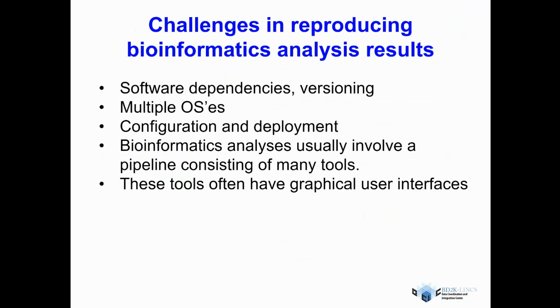So what are the challenges in reproducing analytical results? Now, we've talked about one of them, which is software dependencies and versioning. We can take care of most of that with standard operating procedures. We've shown how multiple OSs, even different versions of the same operating system, can give rise to slightly different results. And even when you're using the same operating system, the configuration, for example choosing the localization settings, can also affect the way things are sorted and potentially affect the results.